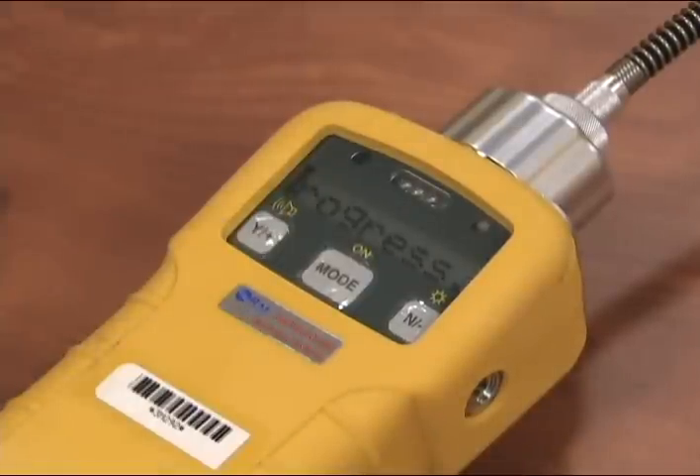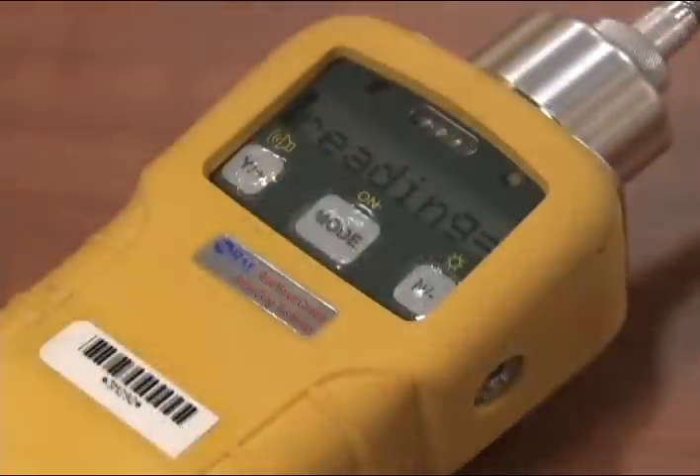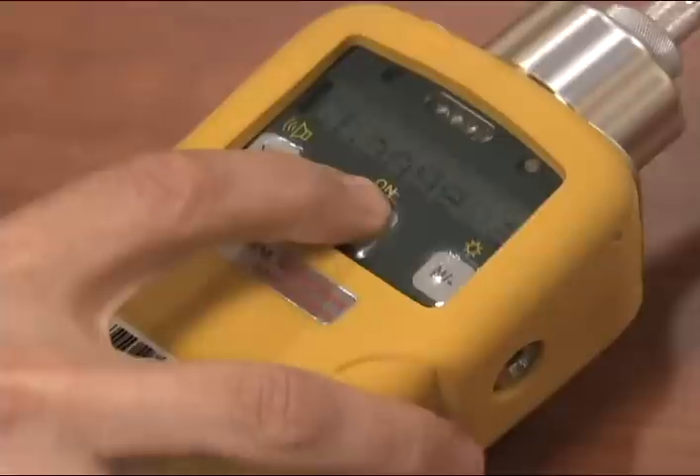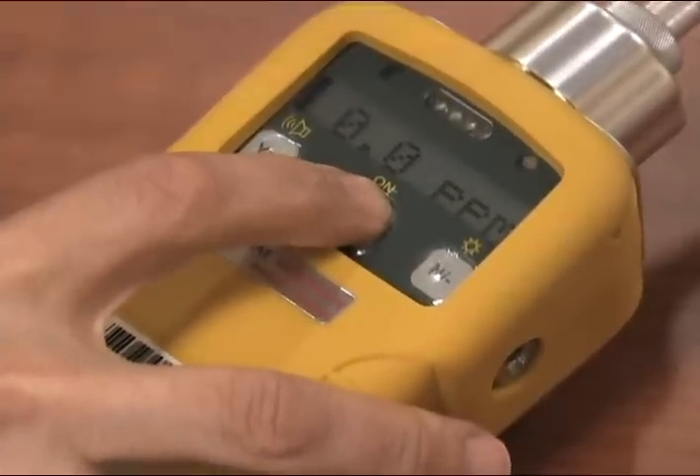When re-zeroing is complete, the screen will display reading 0.0. Push the mode button until the unit shows the flashing L, indicating the unit is collecting data and data logging the results.